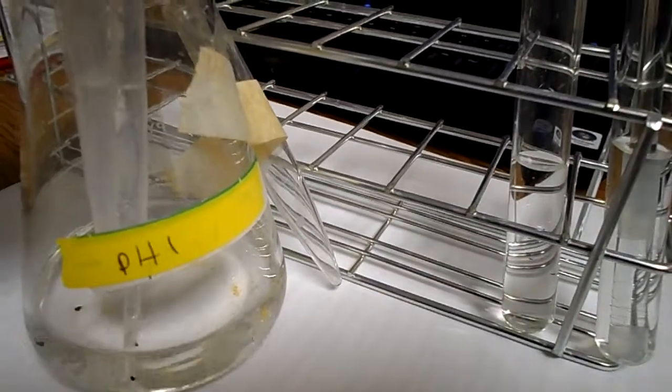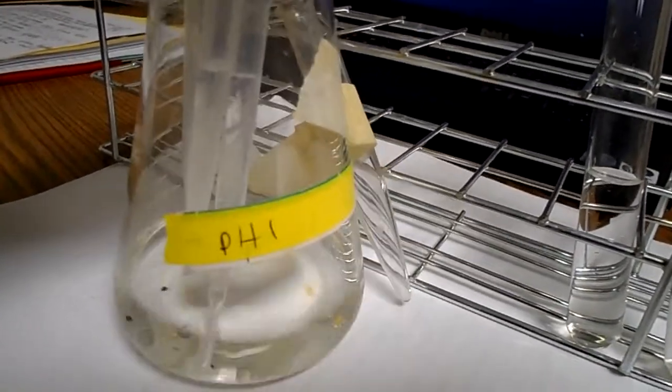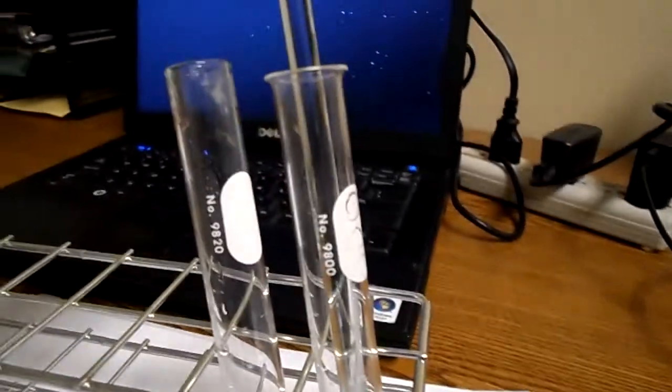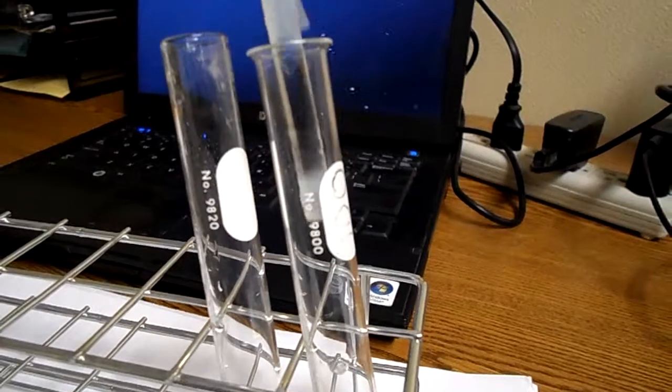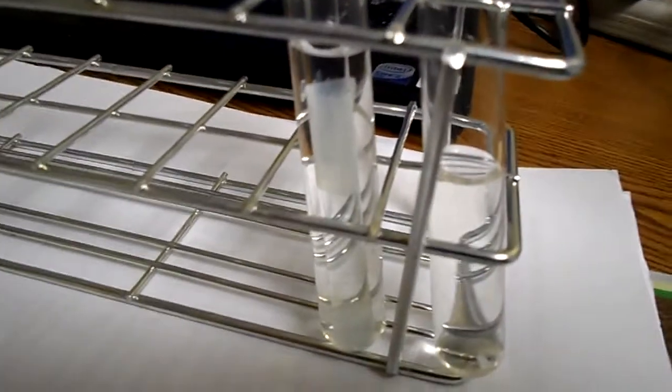Alright, the next step is to submerge the hair in HCL — this is pH 1, which is an HCL solution. Right now I have a second test tube; the first one has the hair on the stirring rod. I'm going to take it out of the base, NaOH, and place it into the HCL, and that will sit for another 15 minutes.